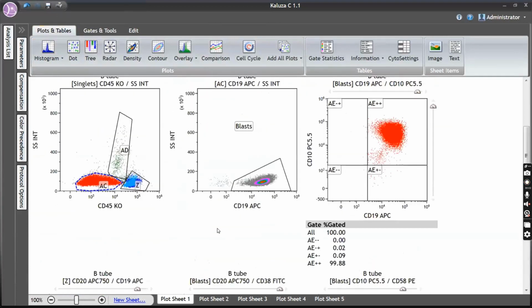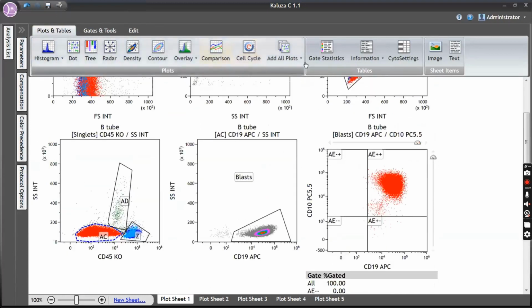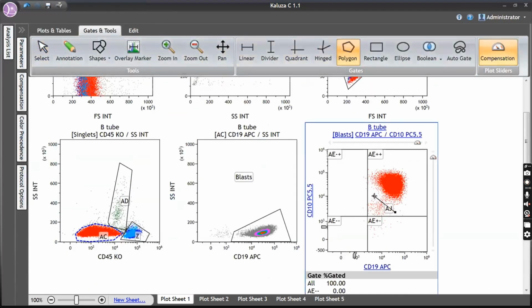So now, from the first step, what is your inference? So I'm seeing blast. Okay. Did we see 22 as well? It is not there in this panel. Okay. But now I'll tell you what. If you are making a panel, see, I've pulled out some cases from the participants, some cases which have come to me for my opinion, or some cases of mine. So I have different panels here. In this panel, 22 is not there. It is better you add CD22.